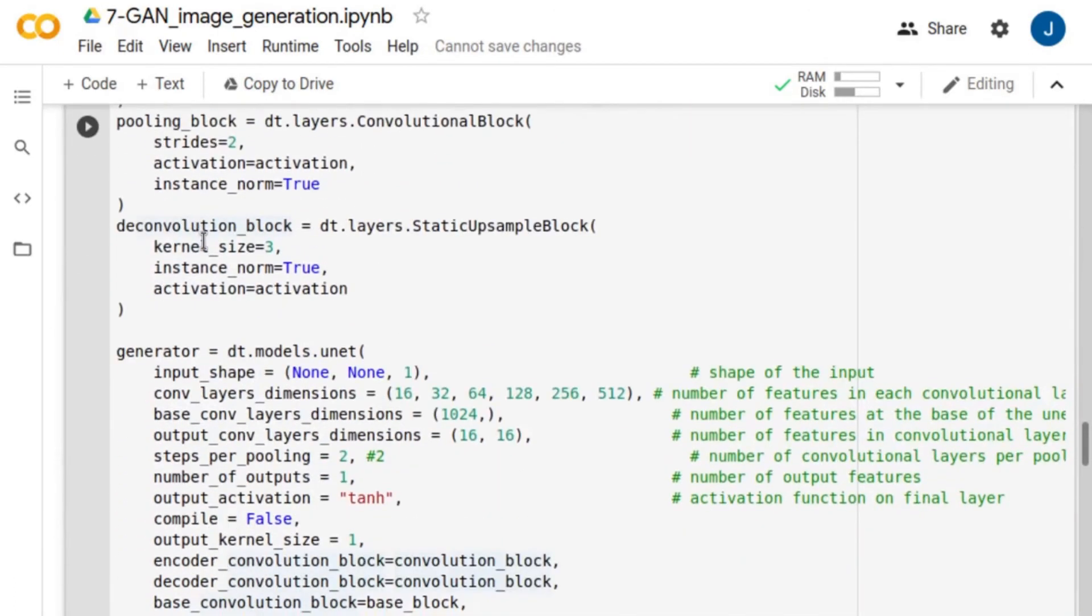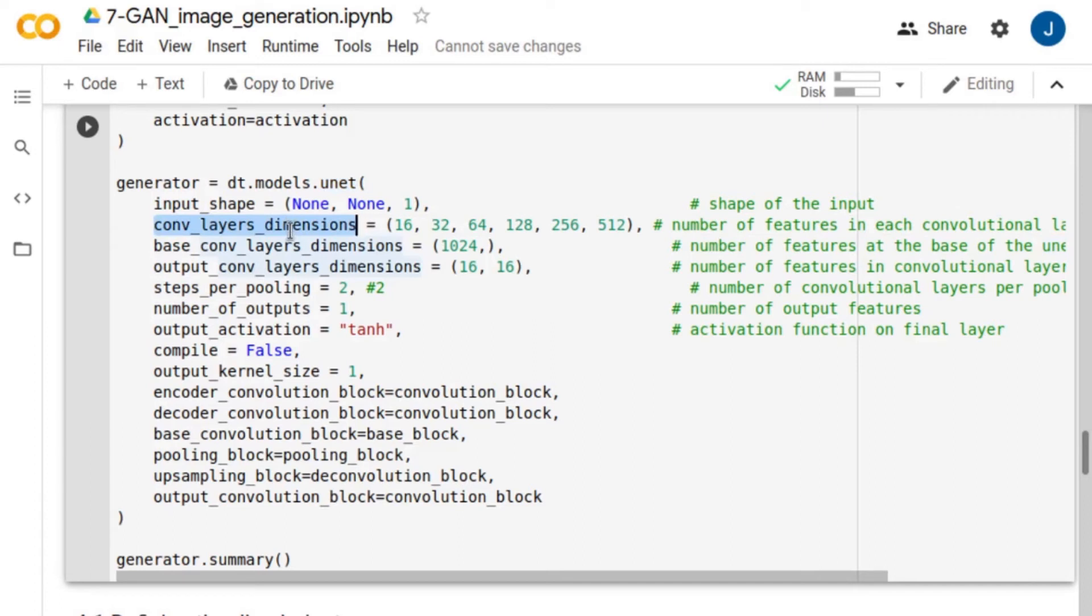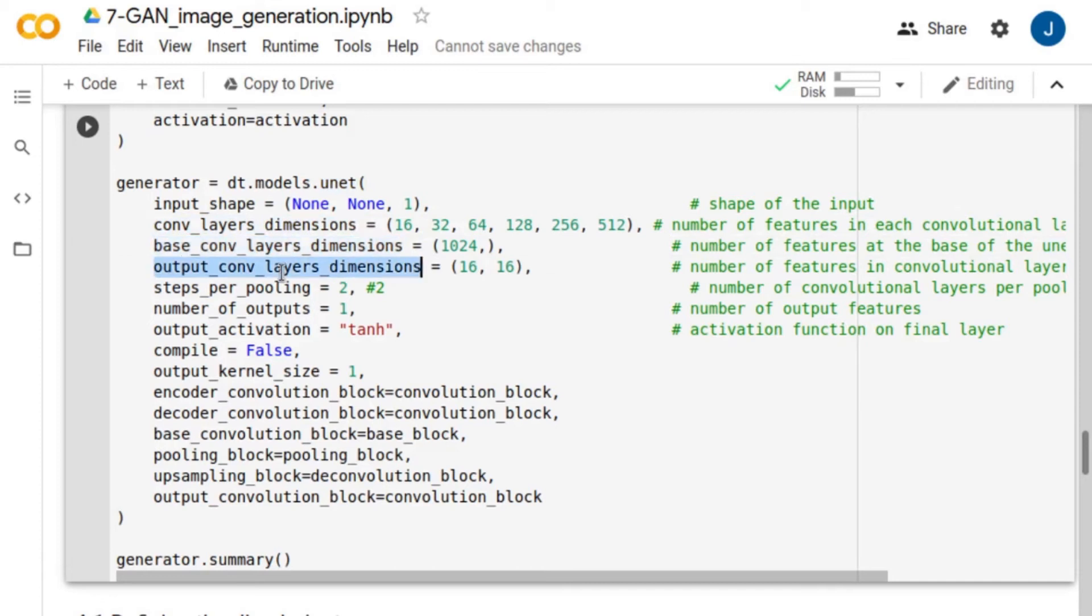In this example, the generator follows a U-Net design. For this function, we define the number of convolutions in each convolutional layer during down and up sampling. Also, we define the number of filters at the base of the unit, where the image is the most down-sampled, as well as at the end of the decoder path. We use the tangential hyperbolic activation function at the last layer of the network.